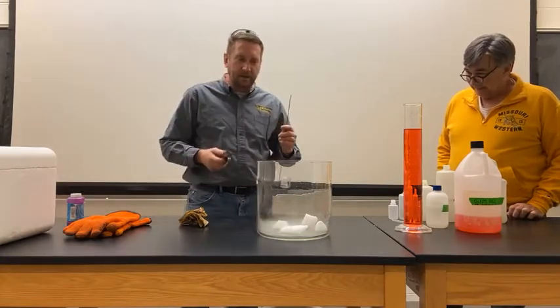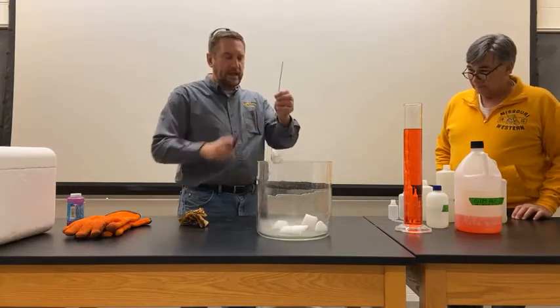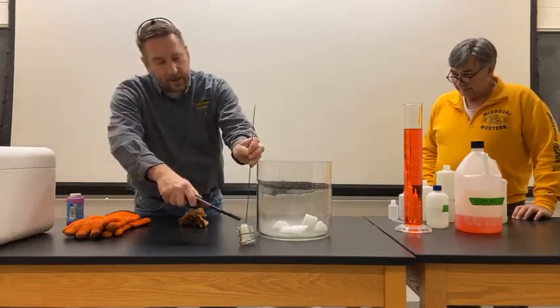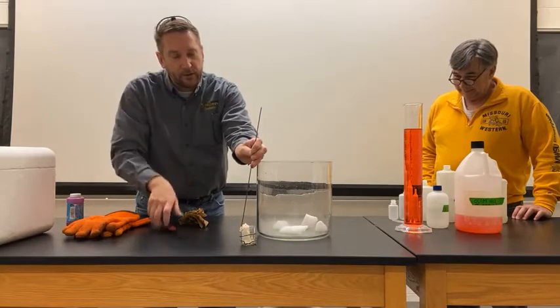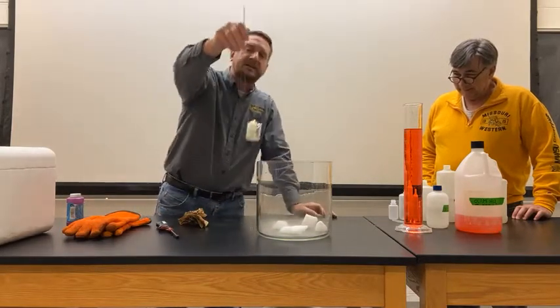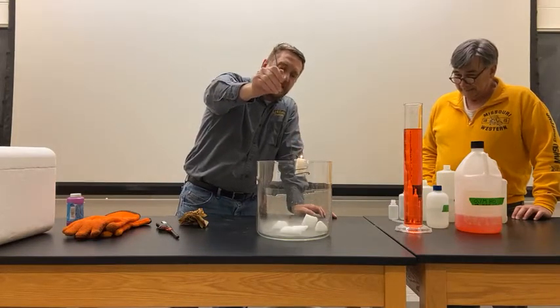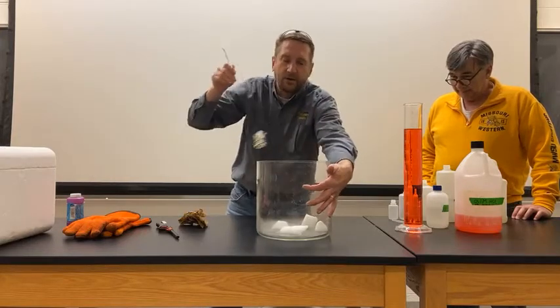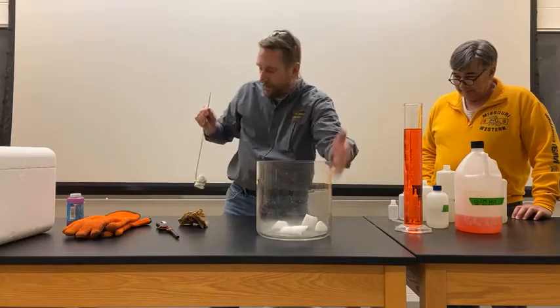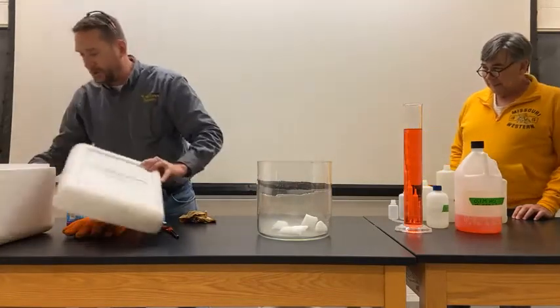Let's check and see how deep the carbon dioxide levels are. So what I'm going to do, of course, carbon dioxide won't support combustion. And so I'm going to take a candle here, and we're going to light our candle. See if I can light the candle better than I can blow bubbles. All right, and I'm going to dip this candle down into our container, and we're going to see where it snuffs out. Okay, so we're about right here in terms of where we're filled up with our carbon dioxide. So let's put a little bit more in there.